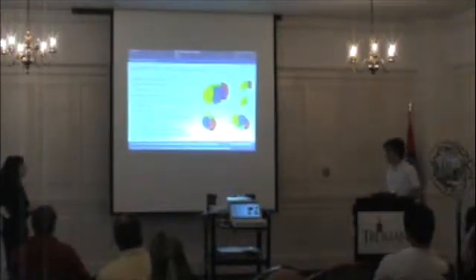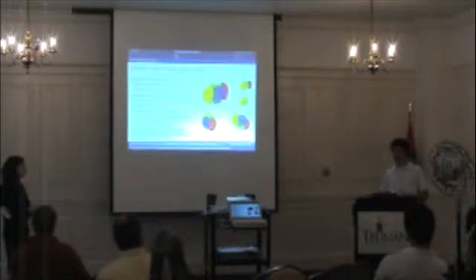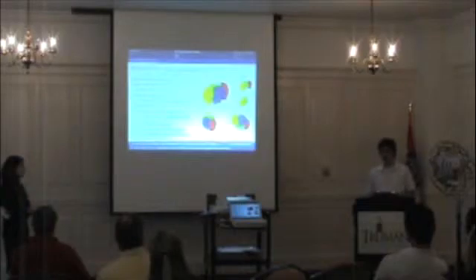The code for centrosome movement is not necessarily a parameter, it's more independent. It's an independent code that models centrosomes within each individual cell. And the way these centrosomes are modeled right now, it's sort of a distance thing. The centrosomes are told to move as far apart within the cell boundaries as they possibly can. And as I'll get into later, this isn't really what we need, but it does incorporate the centrosome, so it's a good step in the right direction so far.